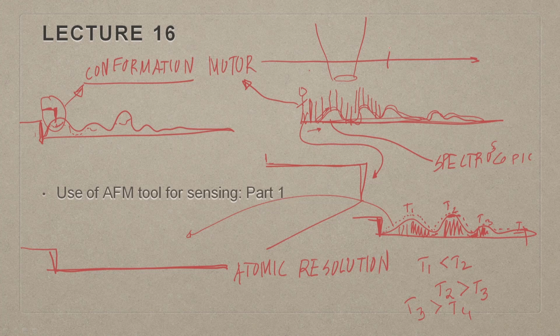So, in a way, what you are trying to do is use and couple AFM with multiple other systems in order to extract information from extremely minute samples. And that is why, as I was mentioning when I started this lecture, most of the techniques which are currently underway are complementing each other in one single platform. So, we derive the maximum amount of information from any given setup.